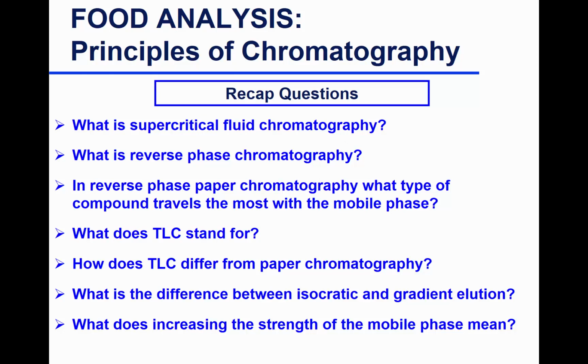If you have a stationary phase that is polar and you want to strengthen the mobile phase, you make the phase more polar than your stationary phase. If your stationary phase is non-polar and you want to increase the strength of the mobile phase, you make your mobile phase less polar.